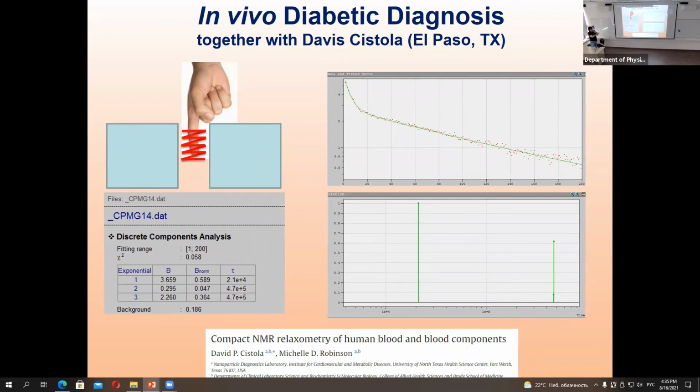Of course, we don't capture bones, we don't capture nails, we don't capture skin. We capture mostly liquids, mostly blood, and of course the composition of blood is also complex. It somehow is related to sugar, but there are some precursors. This is not really the sugar level. I think for measurement of sugar level, you can use much cheaper instruments.